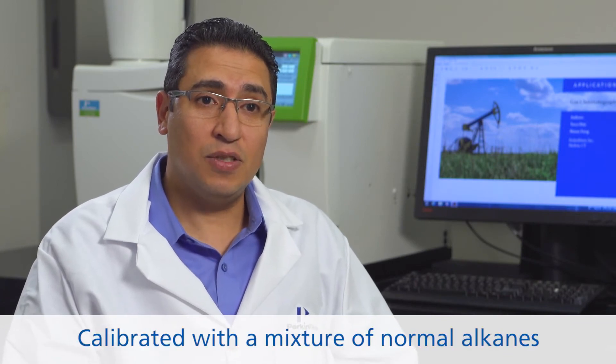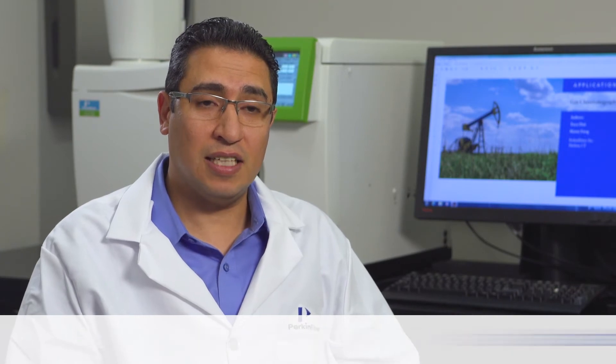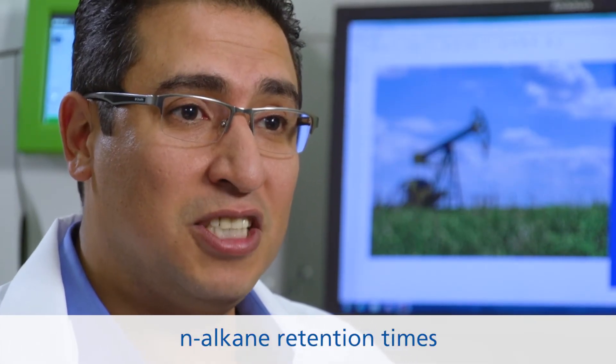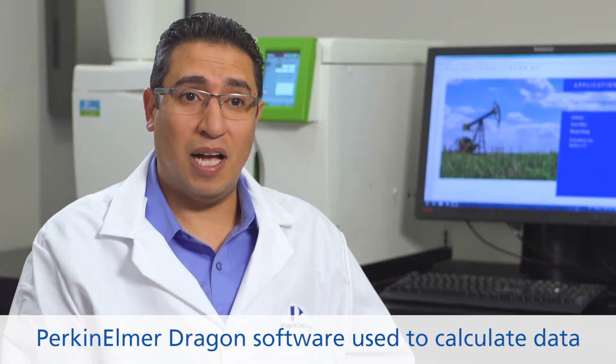I calibrate using a polywax sample and a normal alkane blend. The normal alkanes have known boiling points, and I use their retention times to determine unknown samples, utilizing the Dragon SIMDIS software to calculate the data.